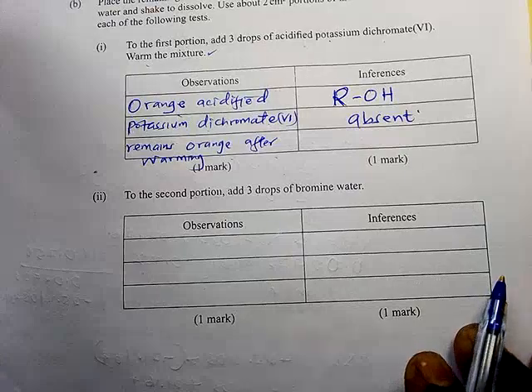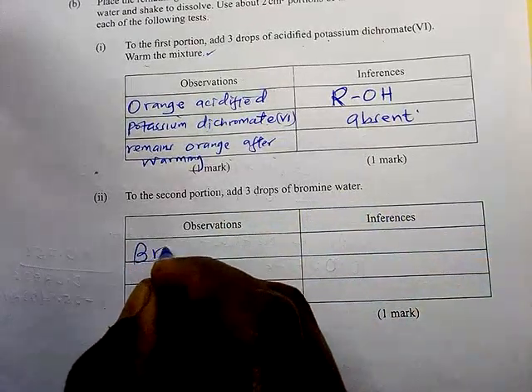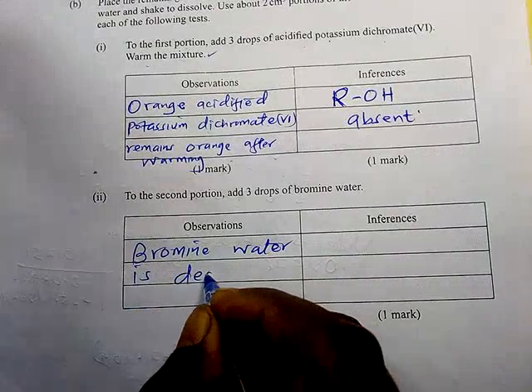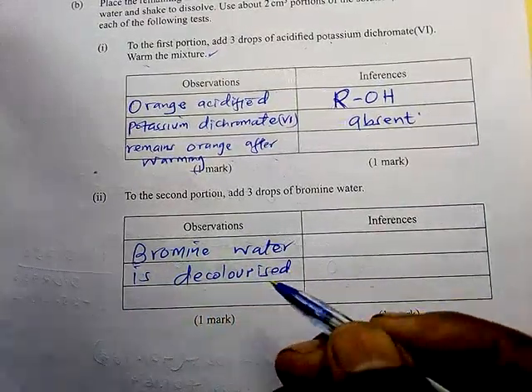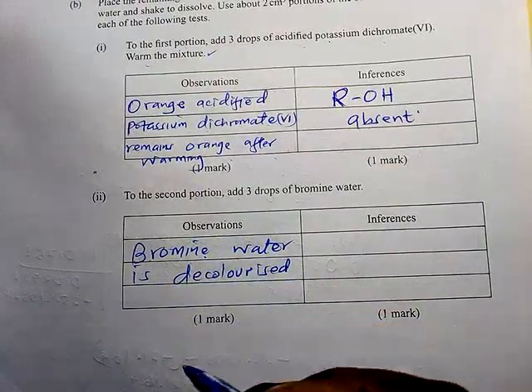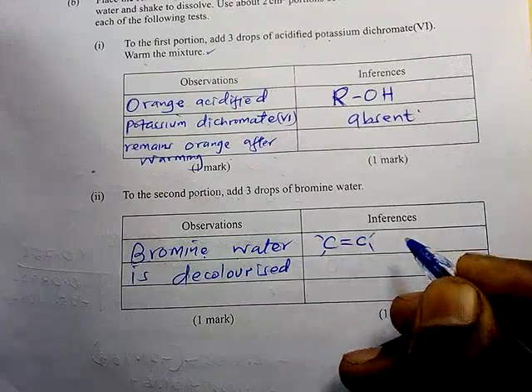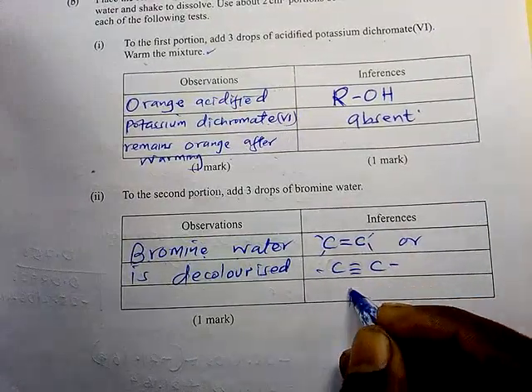For the second portion, add 3 drops of bromine water, and the bromine water is decolorized, or you write that the color of bromine water changes from yellow to colorless. That is what it means. Then it means that the double bond or the triple bond is present.